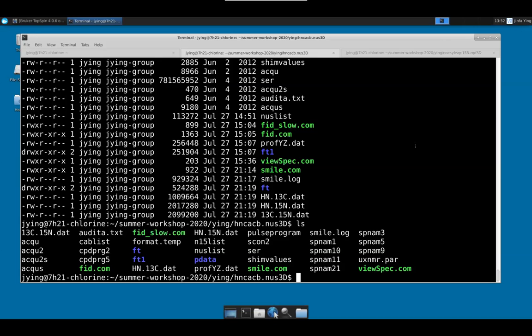Yeah, I mean, the cryoprobe, I think that also is a cold preamp. Probably that has something to do with it. Yeah, so you are right, yes. But more often it happens when you have a single pulse without an echo, followed by detection immediately. Yeah, then it's a problem. Very critical, yes. You are correct, thank you. No problem. Okay.